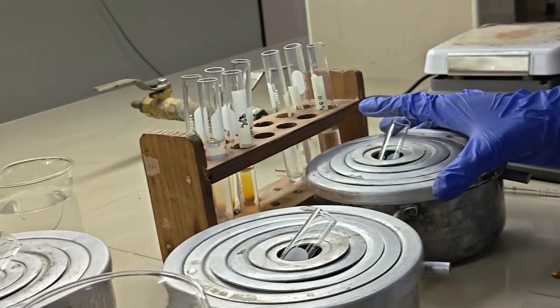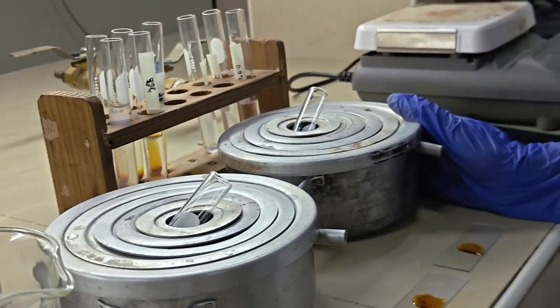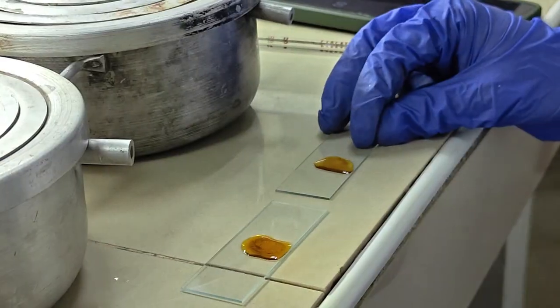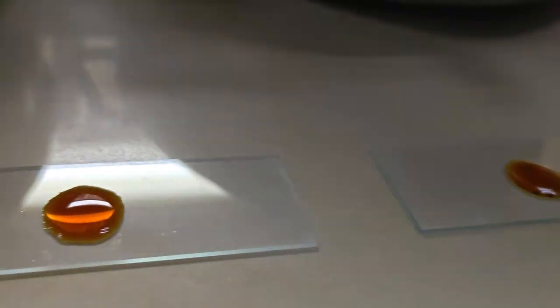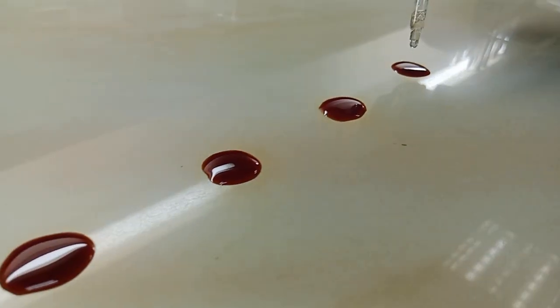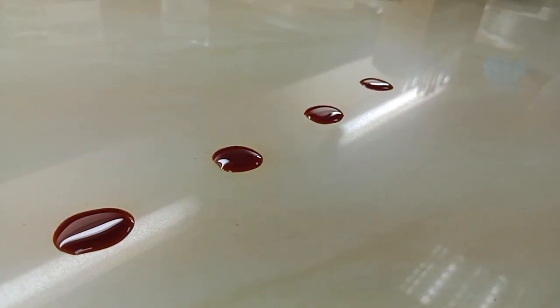After incubation, timing began immediately. Every 30 seconds, 1 drop from each tube was placed onto iodine solution to check if starch was still present. A blue-black color indicated that starch was still present, while no color change indicated complete starch digestion. The time when the blue-black color disappeared was recorded as the starch digestion time.